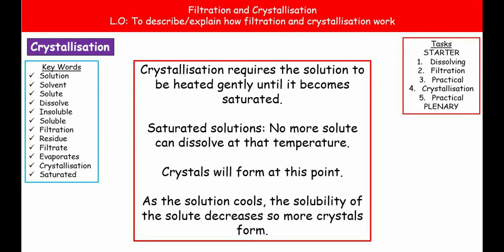So what we see happening during the process of crystallization is that we're going to be heating up our solution, and when we heat it, then the solvent is going to evaporate, leaving us with crystals of our solute. The reason that we're going to use the beaker of water and not just heat it directly onto the evaporating dish is because we need to do this as a gentle process.